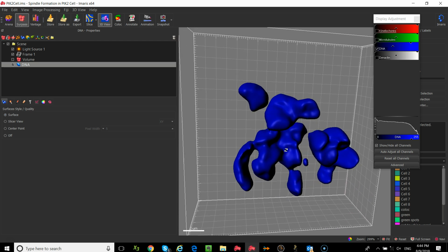So next thing I'm going to do is I'm going to create a 3D distance map. I'm going to make 2 of them. Now I'm hoping your iMacs are okay with this because I'm going to be adding new channels. And these iMacs are really not Imaris workstations. They're just for the purpose of tutorials. So when we add more channels, it puts more stress on the graphics card, which is pretty minimal on these systems. So I'm hoping you don't run into any problems.